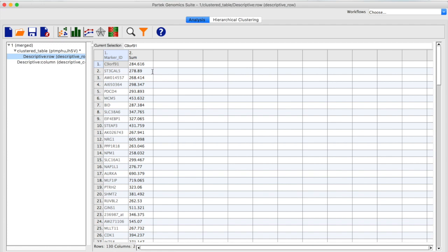It's got some really unique things about it, so I'm really excited to show you what that can do for your experiment. And again, it's a little different in the fact that it's using the actual data in its database to draw its conclusions rather than text mining a bunch of publications. So we will do that right now.